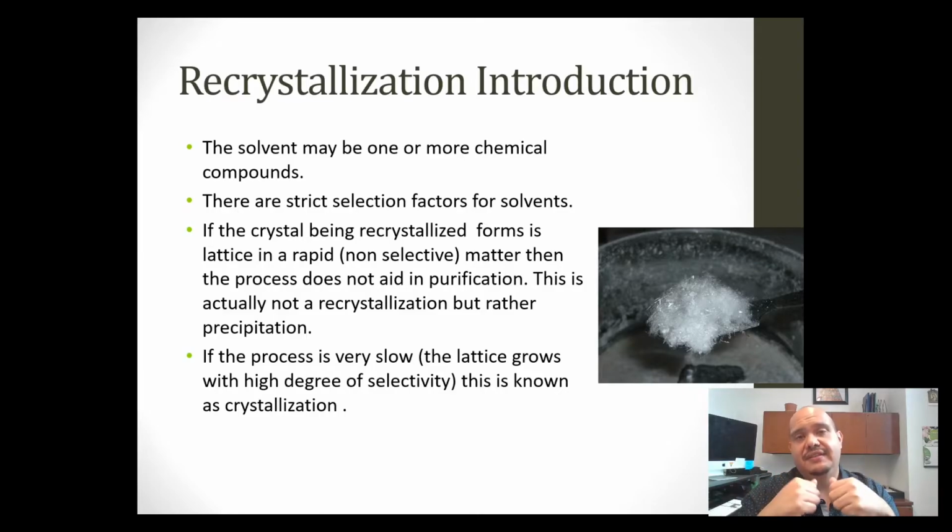The crystal that you get will be identical in chemical makeup to what it started as, but it will no longer have the impurities that would affect not only the identity and the spectra, but also the melting point. Next week we are going to talk about melting point and mixed melting point and how these two labs go hand in hand with one another.